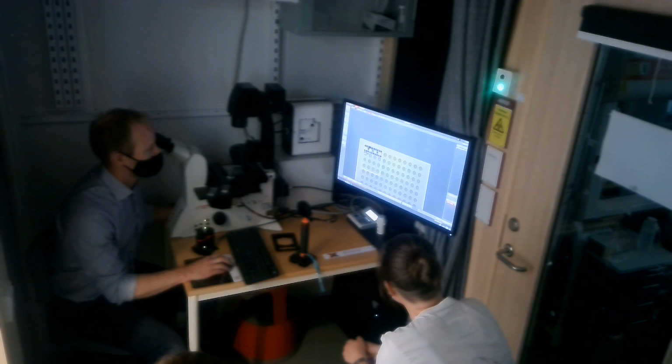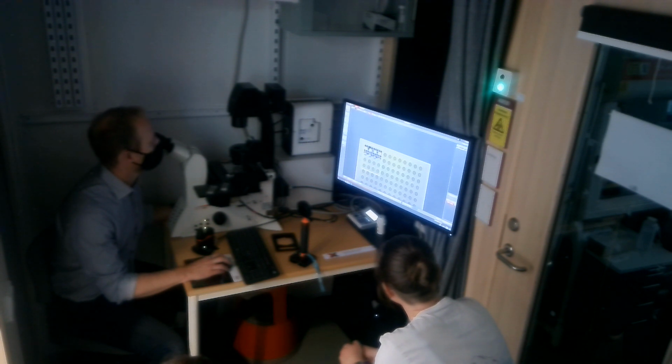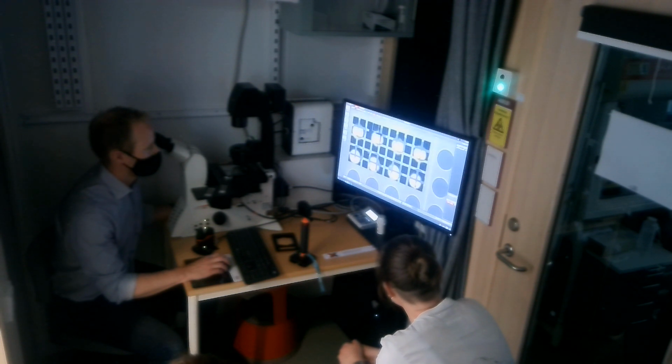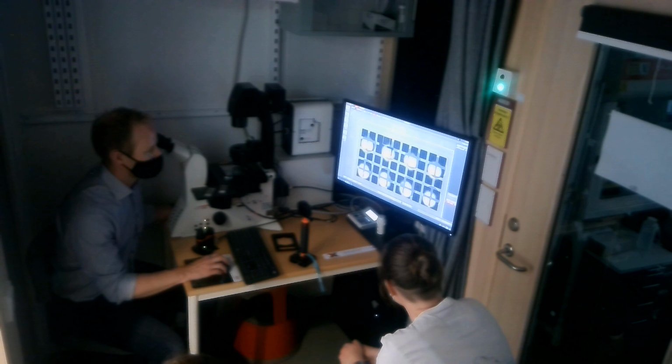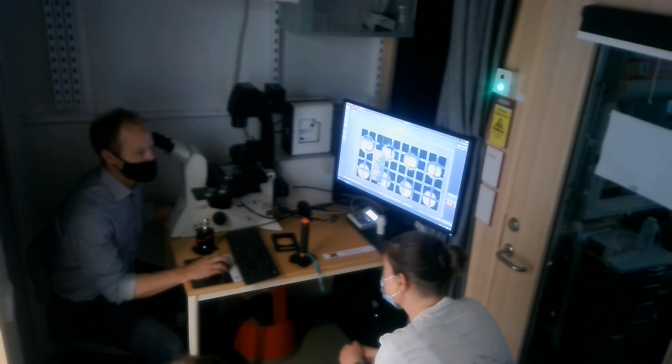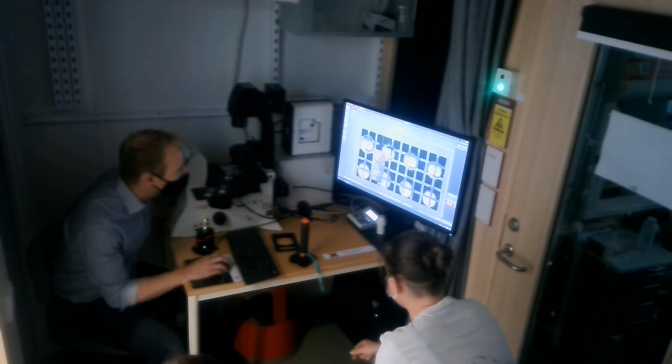So I will stop this quite soon. I thought I would do these rows also. And of course, once we have the manufacturer of this one, we can add display to it. So this could allow me to more or less draw some circle. Let's say something like there, basically. I think I can. And if you, so you would do some random stuff in there, yeah. No, I don't have to capture all of it.